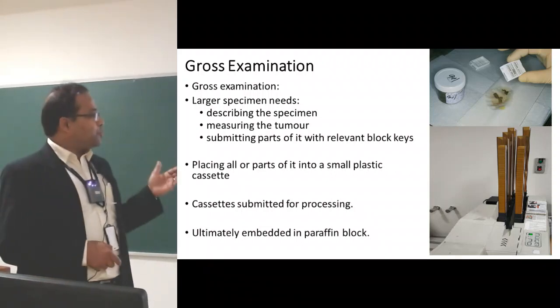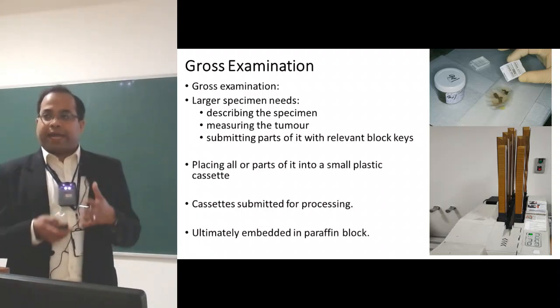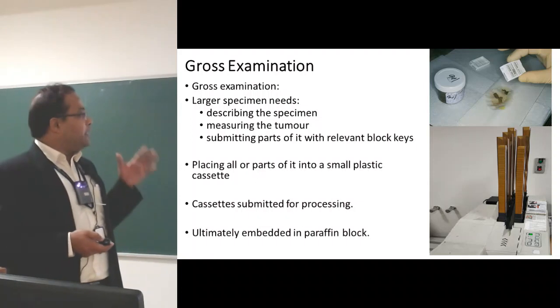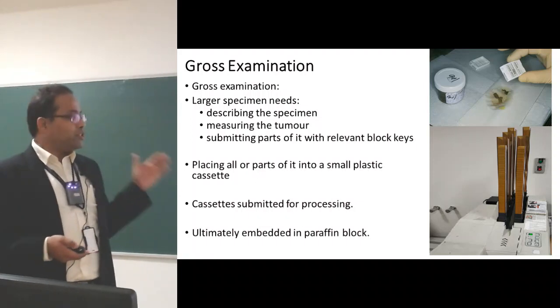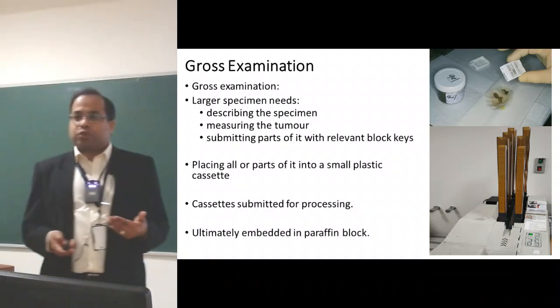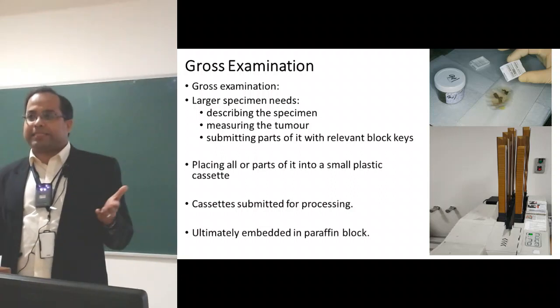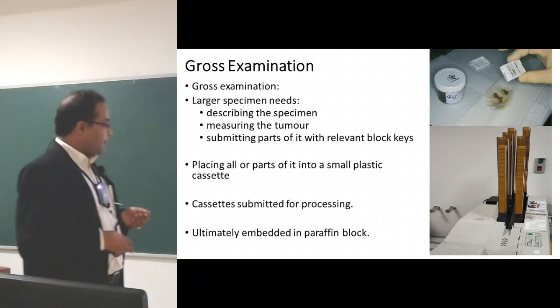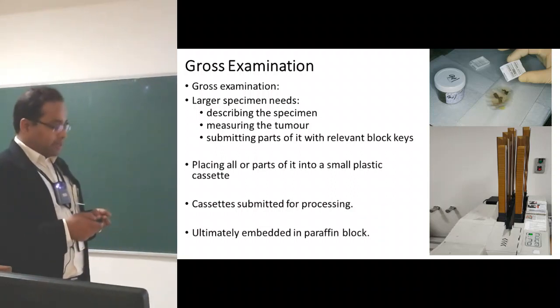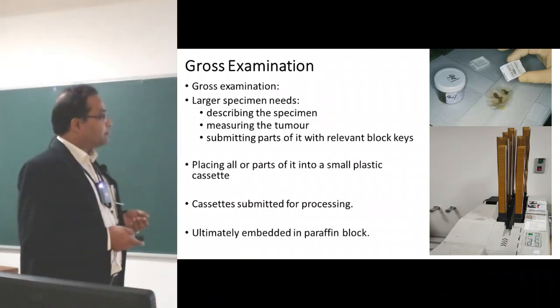But for larger specimens, such as big pieces of bowel or any tumor of the head and neck, we need to describe the specimen, measure the tumor, and submit parts of it with relevant block keys, so that they help us not only in diagnosis, but also in the grading and staging of the tumor. The cassettes are then submitted for processing and ultimately embedded in a paraffin block.